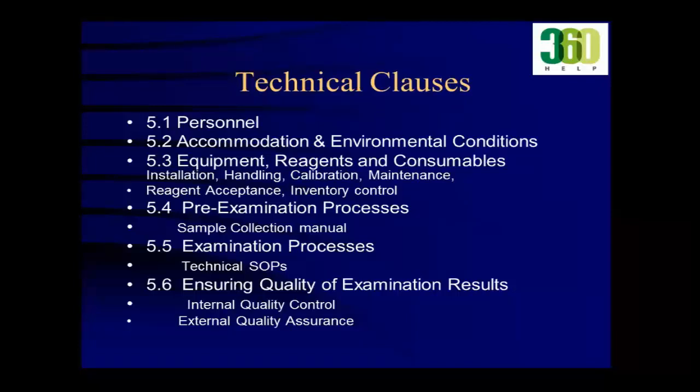Starting from taking the tissue, putting it in formalin, what kind of bottle, how much percentage of formalin, who will bring it, who will label it, what label, ID of that patient, name of that patient, particulars of that patient, male, age, everything has to be put in the form of a SOP which makes a sample collection manual.